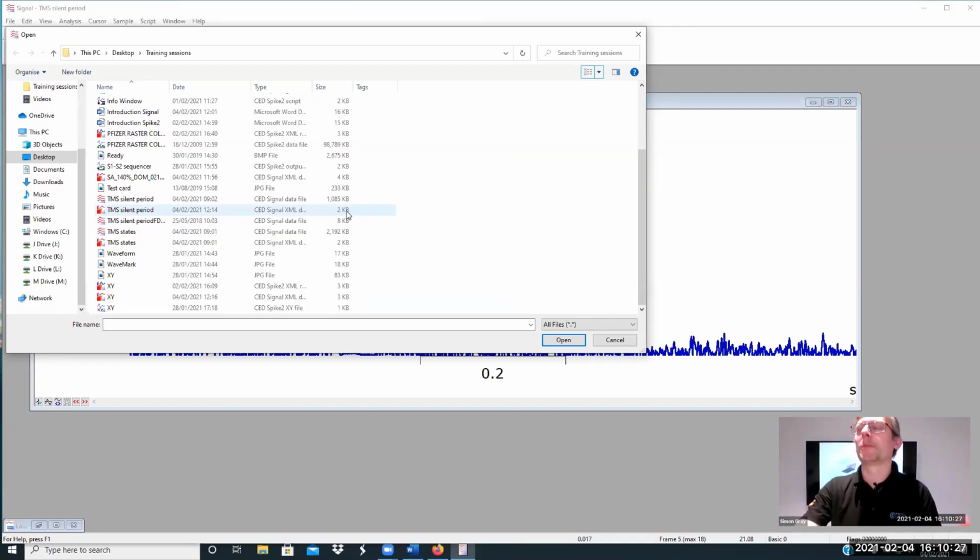And that holds all the information about the drawing styles, line thicknesses, what you saw last time you closed the data file, which means that when you open the data file again, as in you've left on a Friday night and you're back at work on a Monday morning, pick up that same file. As long as the resource file is there, the data will appear as you left it.